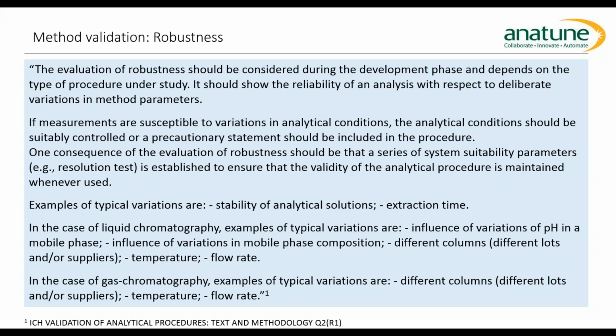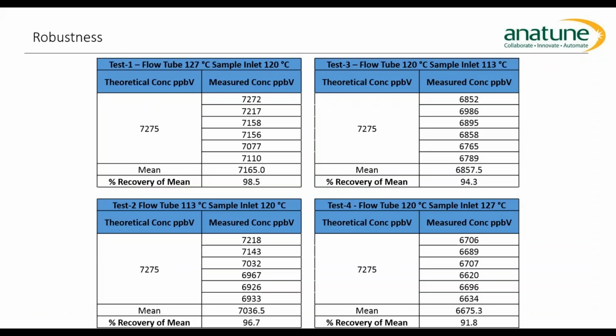So what can we do with SIFT-MS, bearing in mind that there isn't a lot to change with the SIFT-MS method and the SIFT-MS instrument? Really, when we looked at the only things that can affect the methodology, it would be the temperature of the sample inlet, as this would affect the flow into the system, and flow will determine concentration, and also the temperature of the flow tube where the reactions are taking place.